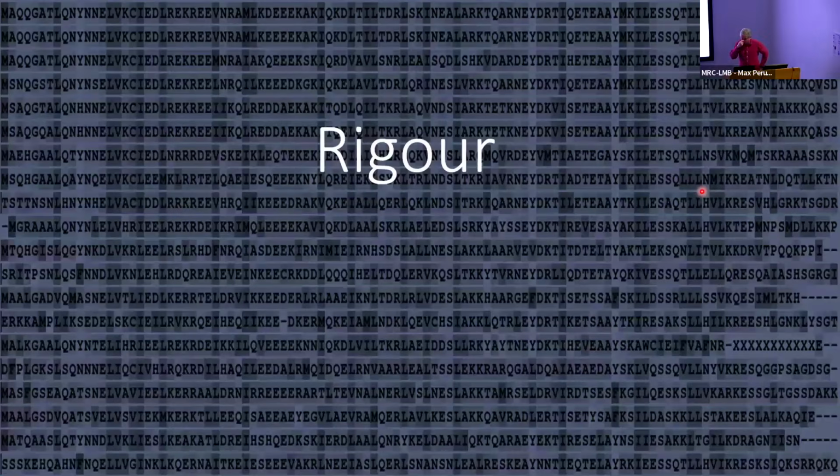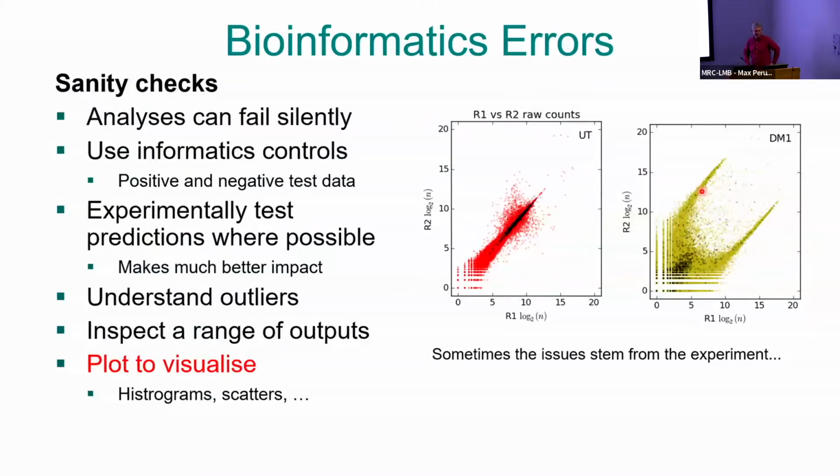I just want to talk a bit about rigor in bioinformatics, because it's often forgotten. People often do bioinformatics in a panic when they need to write a paper. However, we need to be cautious, and over the years, I've come increasingly to think of bioinformatics as just another kind of experiment that you have to have controls for. Okay, I've had things fail silently until you realize that figure looks wrong when you're just about to publish. So I encourage you always to include controls in your bioinformatic analyses, positives that should always work, negatives that should fail.